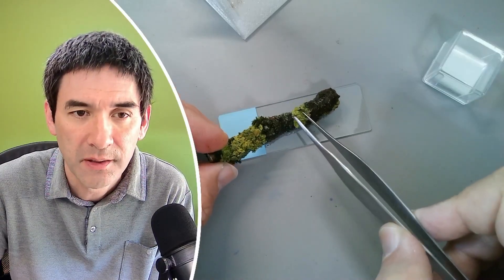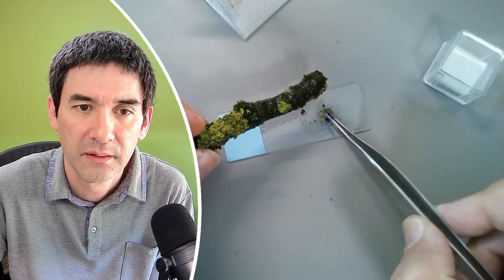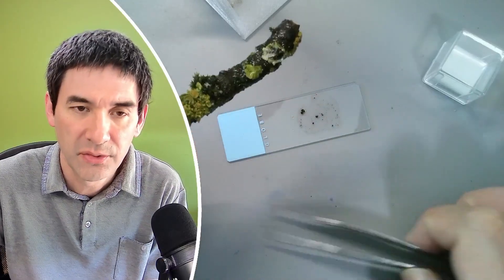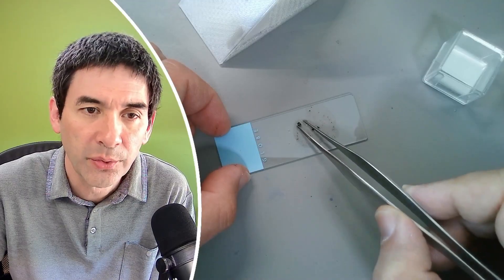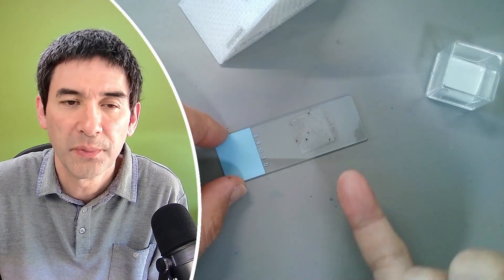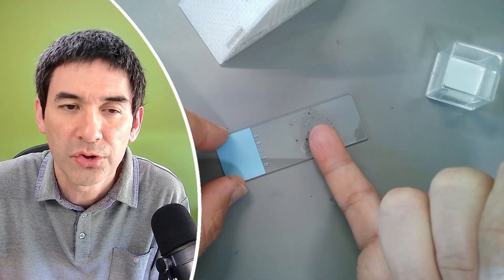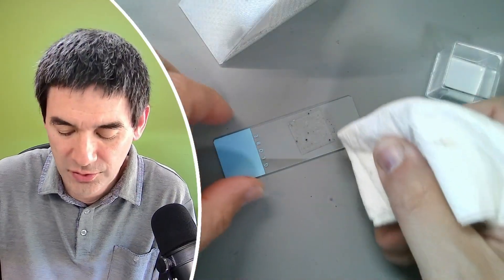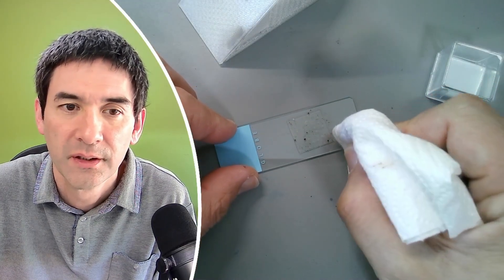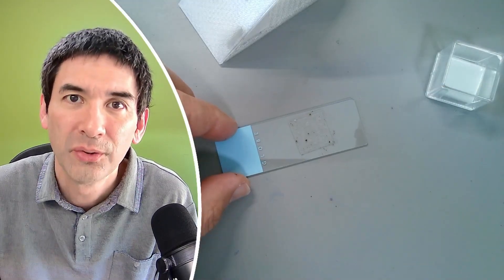Some lichens here as well. I think this should be enough — I'll put it back into the container and now remove the slightly larger pieces. The cover glass goes on top, but you can see there's still a lot of air in here because some of the particles are still too large. I'll remove any excess liquid as well. I want to make sure that the cover glass is completely flat and does not float — and now we're ready to observe.